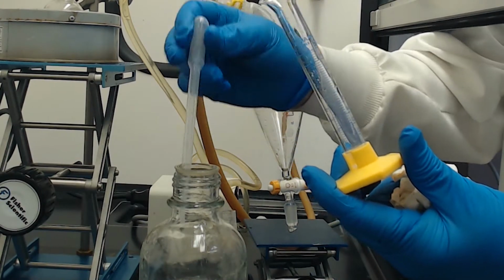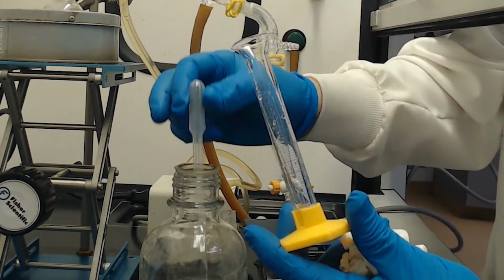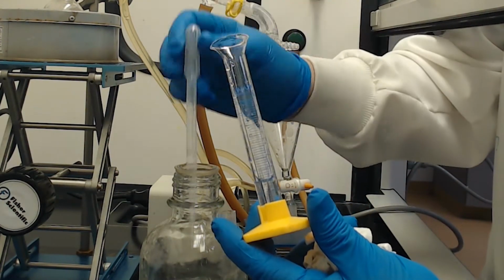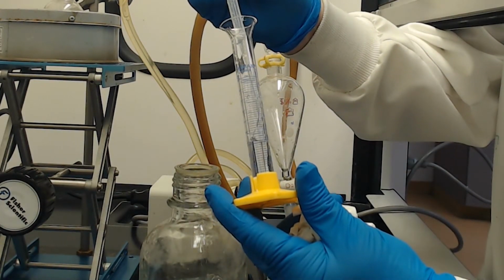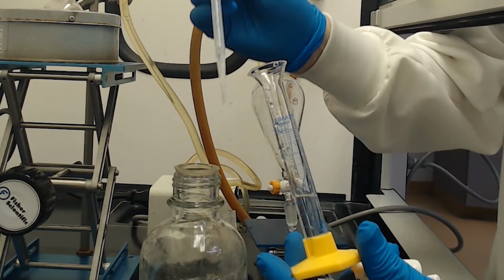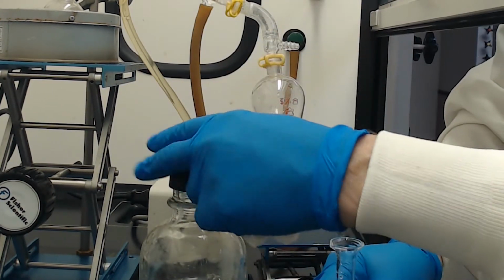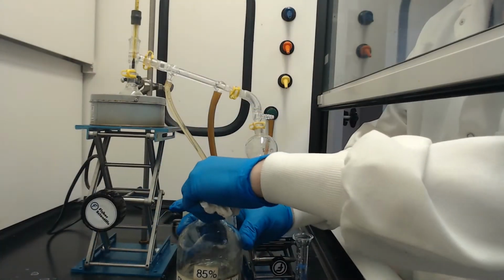4 milliliters. It's about 3. So there's 4 milliliters. Okay. Phosphoric acid. Cap that up. Put it in a safe location over here.